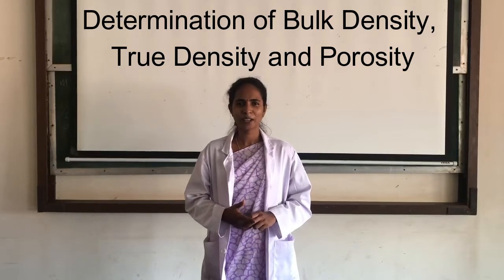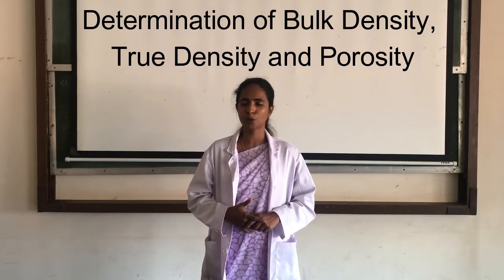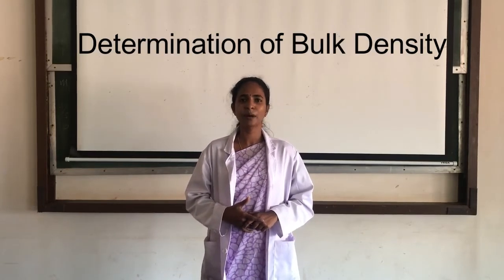Hello guys, welcome back to the practical session. Today we are going to demonstrate the determination of bulk density, true density and porosity. First, we will see the bulk density.